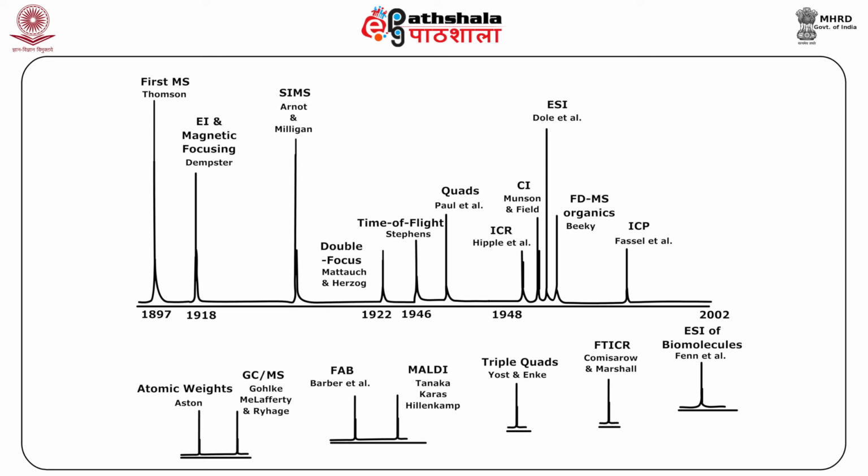Now, rapid improvement in various technologies has led to the development of better mass instruments, which helps a chemist in detection of unknown compounds and confirmation of the known compounds and their formation. This diagram aptly describes the historical development of mass spectrometry techniques, and it makes one appreciate how much effort has gone into designing and making the technology more suitable year after year, so that the chemist can do better work and provide better service to society.